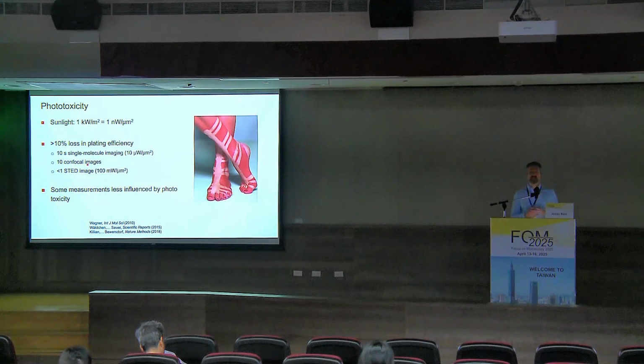So this sounds bad, but on the other hand, there are many processes that are not directly affected by phototoxicity, or much less so. And if the process that we are looking at is not affected, we don't care if the cell still divides later, or even if it blows up 5 minutes later. But this is really a warning. It is very important if you do live cell super resolution microscopy to always test for this, to always make sure that phototoxicity doesn't affect what we are looking at.